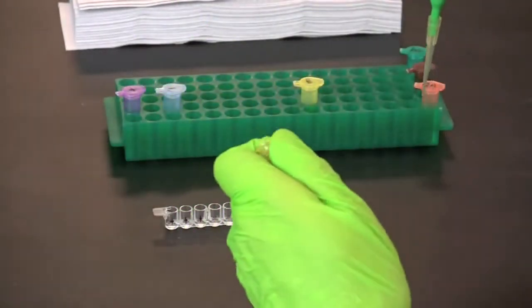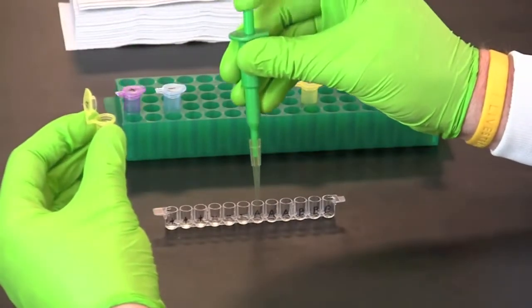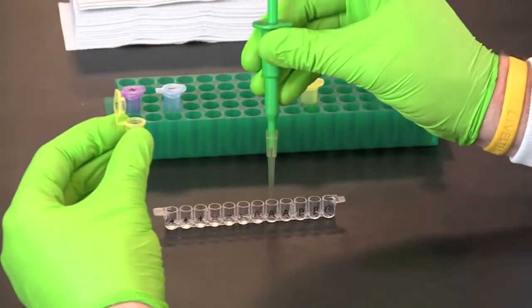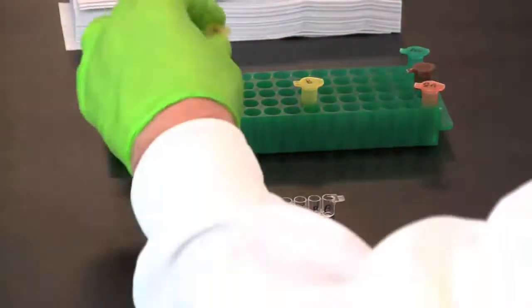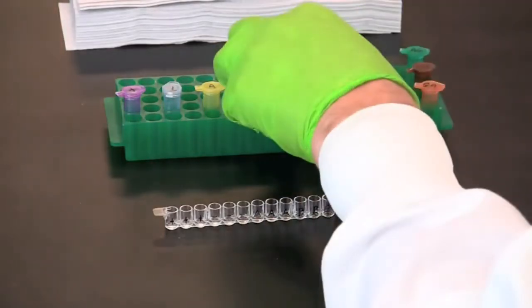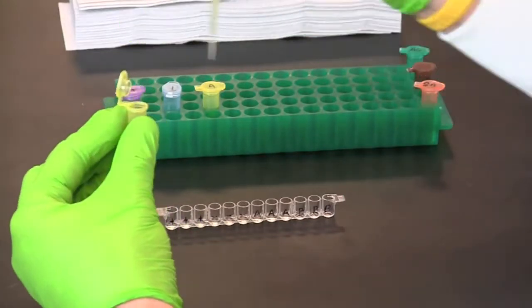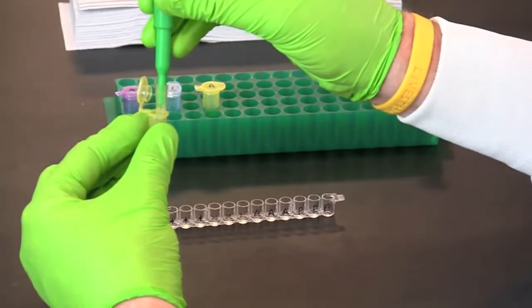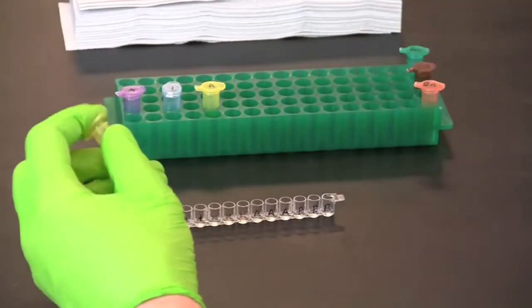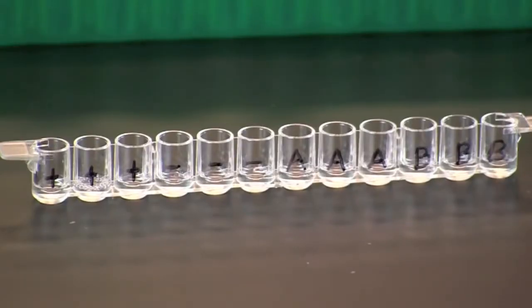Use a fresh pipette tip to transfer 50 microliters of the negative control into the three wells labeled minus. Use a fresh pipette tip to transfer 50 microliters of each serum sample into the corresponding three wells, remembering to use a fresh pipette tip for each different serum sample. Incubate the samples for five minutes at room temperature so that the serum antibodies can bind to the antigens.